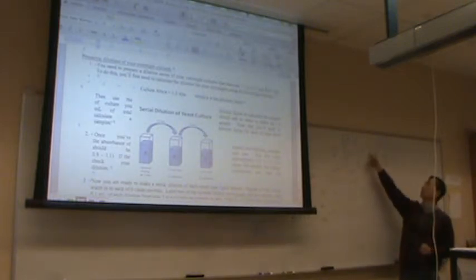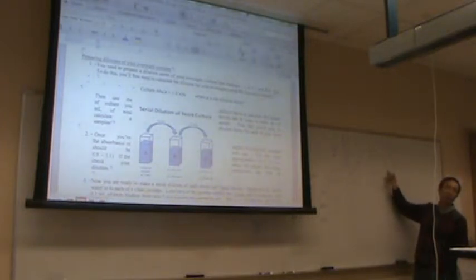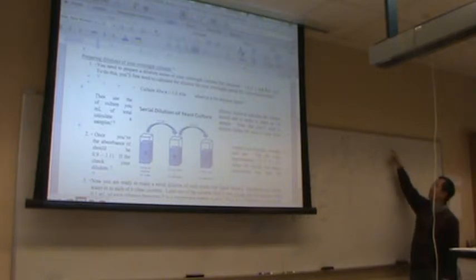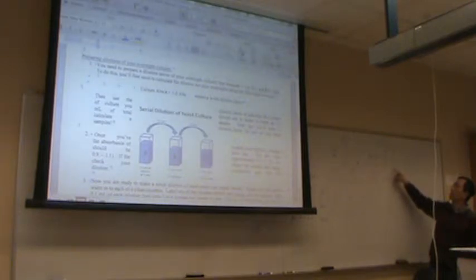Basically the cells are resuspended and then we take 10 microliters of that into the next tube which is labeled 0.1x and then add 990 microliters water. That's the 0.1x dilution. Then do another 10-fold dilution: 10 microliters plus 90 microliters water, that's your 0.01x.